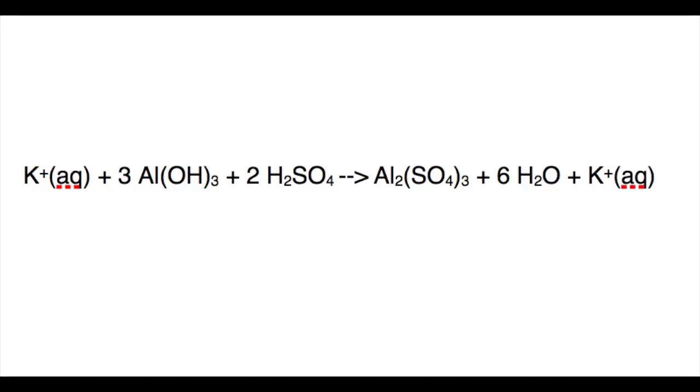After waiting for 30 minutes and adding more sulfuric acid, the solution was immediately placed in an ice bath, rapidly decreasing the solubility of the mixture, causing an alum mixture to precipitate out of the solution. We then filtered the water out of the alum precipitate by using the Buchner funnel attached to a vacuum pump. We mixed the materials until the funnel stopped dripping and then stopped the pump.